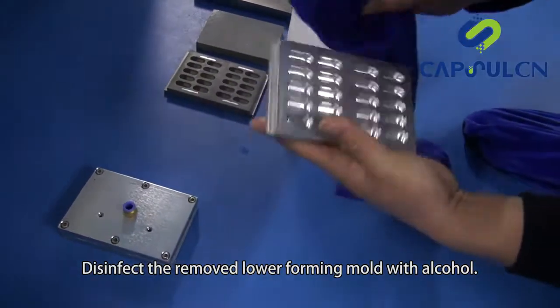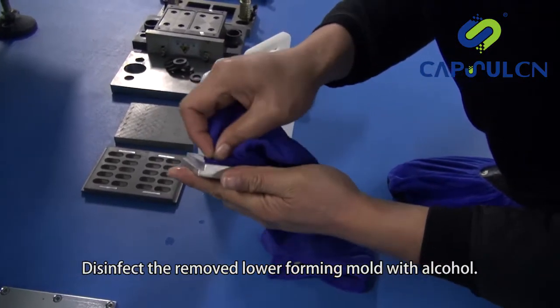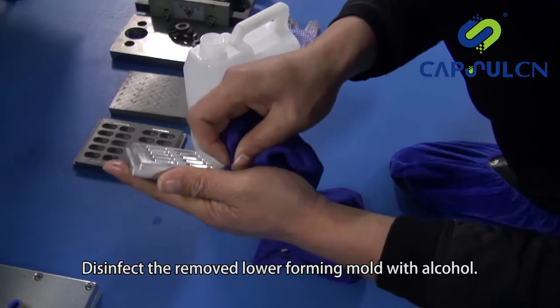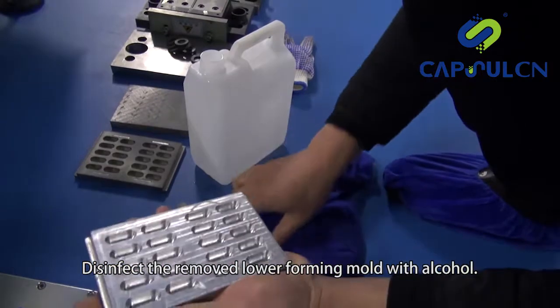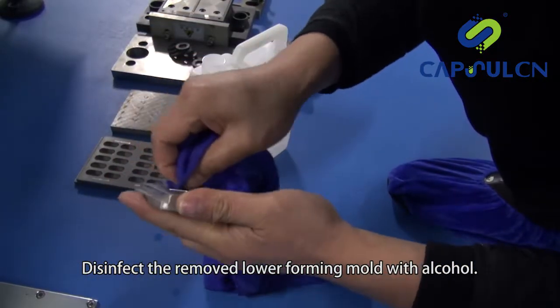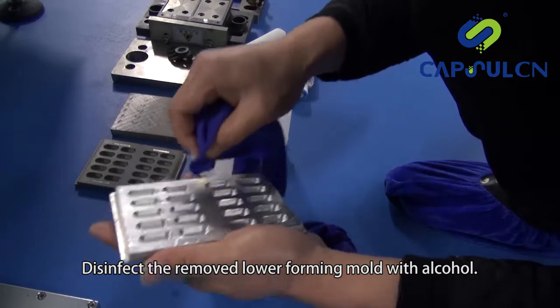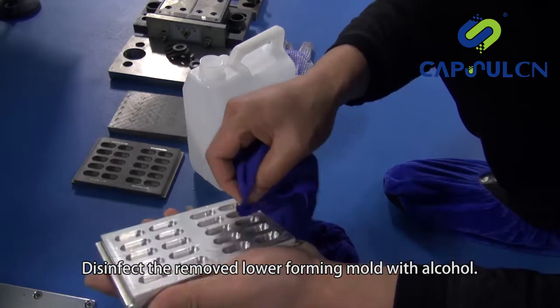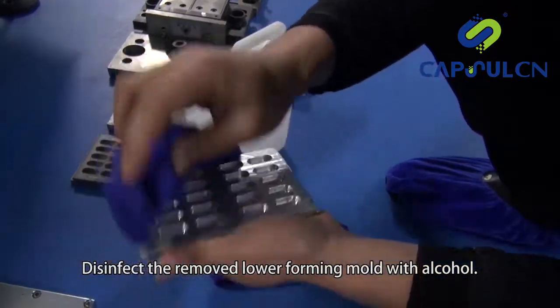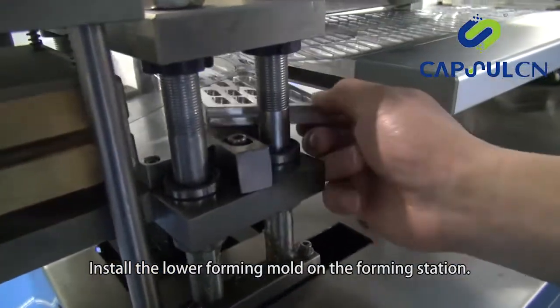Disinfect the removed lower forming mold with alcohol. Install the lower forming mold on the forming station.